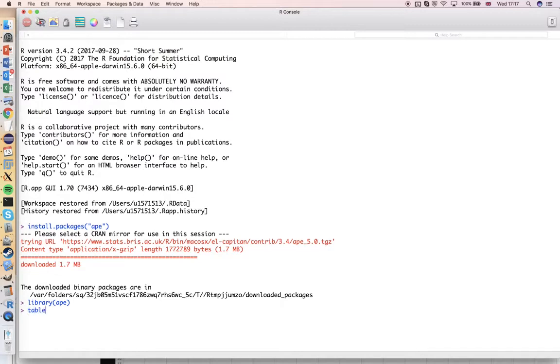First, we need a name for our table. Let's just call it table. Then you do a little arrow, and you type read.table. I'm going to leave just a comma there for the meantime. header = TRUE, and the TRUE has to be in capitals. row.names = 1, because the first column of the area selected is the row names. And sep = "\t" in quotes. The separator, the symbol that means this is the end of one cell or one column and the start of the next, is a tab character, and that is represented as \t.